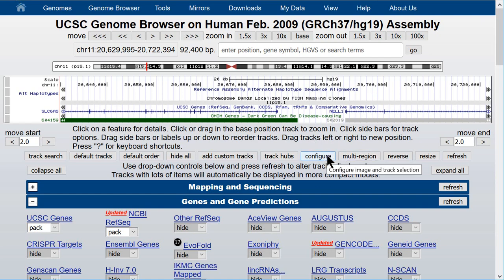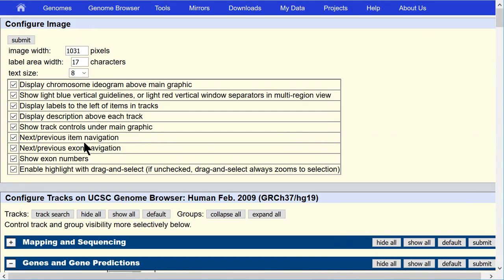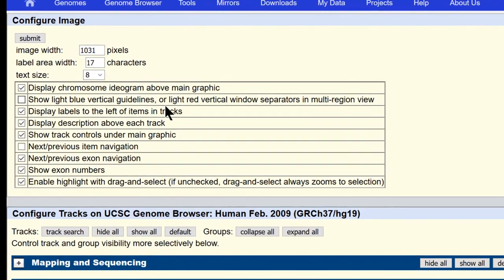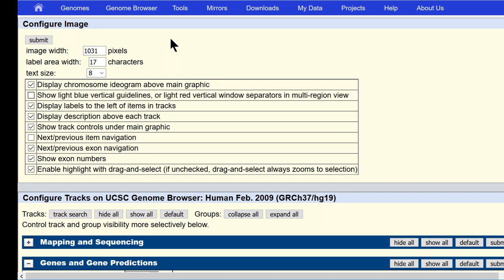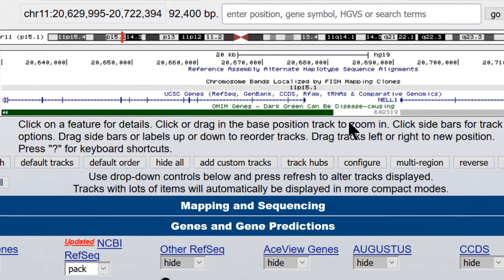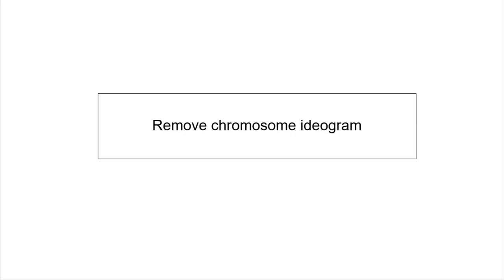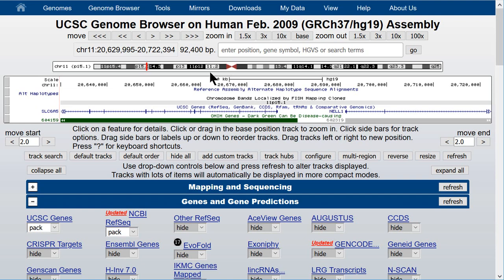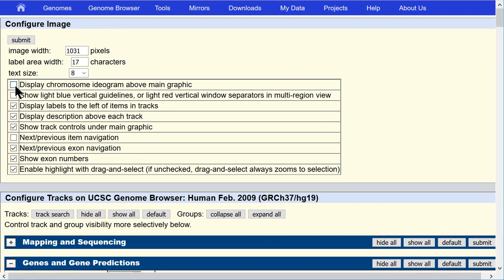Going back to the configuration page, we'll turn off the next/previous item navigation and also turn off the light blue guidelines in the browser image. Some people prefer to make images for papers or posters without the light blue guidelines. After submitting, we have the same image as before without the blue lines. The chromosome ideogram at the top is also optional — we can go back to the configuration page and turn off the ideogram and the blue bars.